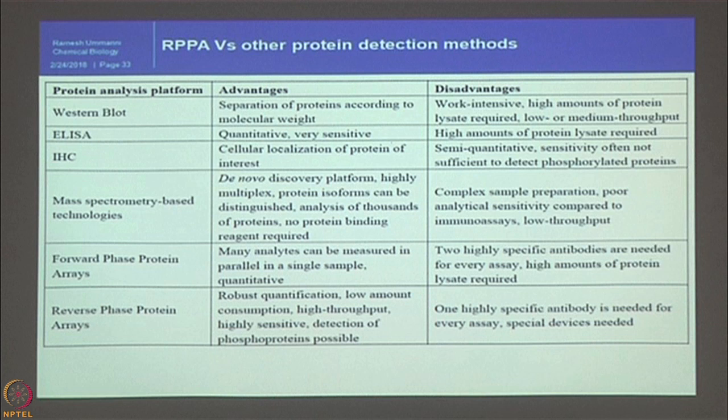I am not claiming that it will overcome all the disadvantages of the other methods mentioned here. It also has a limitation in that it requires highly specific antibodies, every assay needs to be optimized, and special devices are required for this technique as well. So this is how the RPPA works.